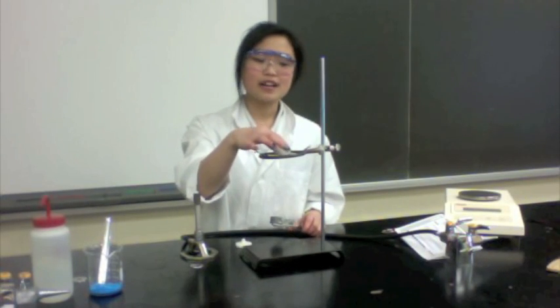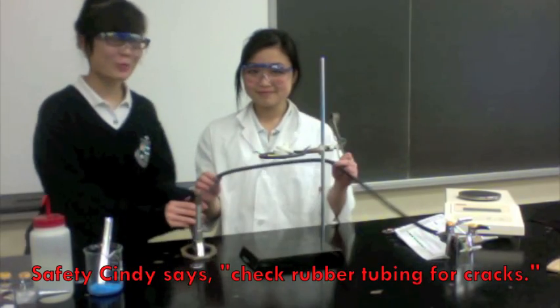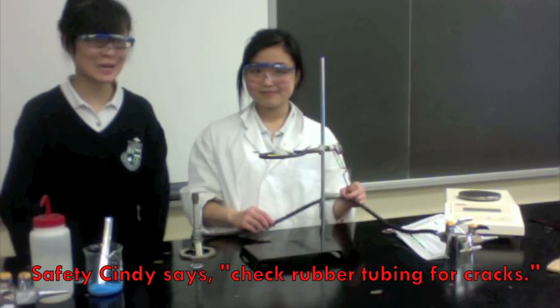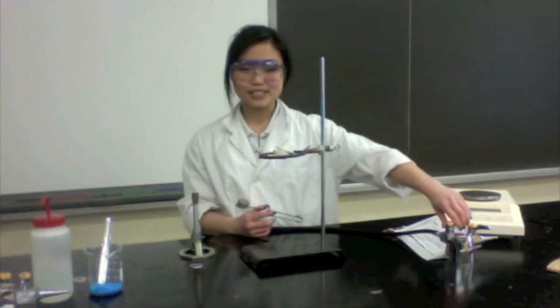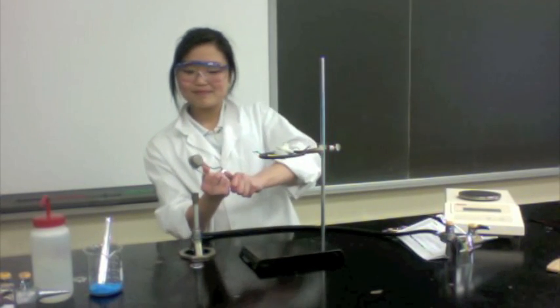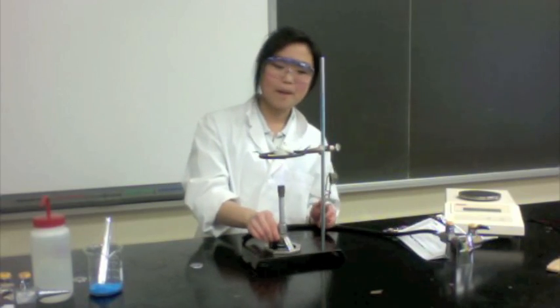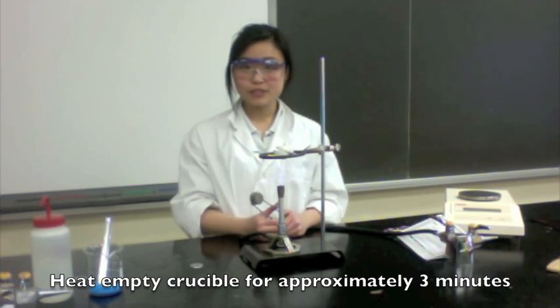Place your clean, dry crucible on top of the clay triangle and keep the lid slightly off. In this step, we are going to heat the crucible to evaporate any remaining moisture, in case someone used it before. Safety Cindy says: always check the rubber tubing for any cracks so that no gas leaks out while lighting the Bunsen burner. Turn on the gas, and then ignite the fire by rubbing the flint. Adjust it to your preferred heating and put it under the crucible. Leave this on for 2–3 minutes.